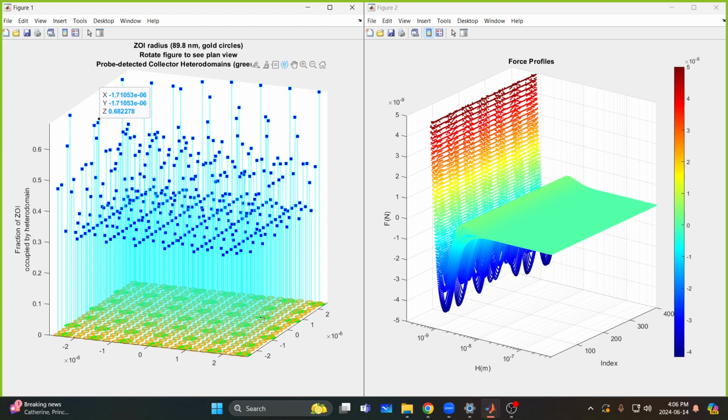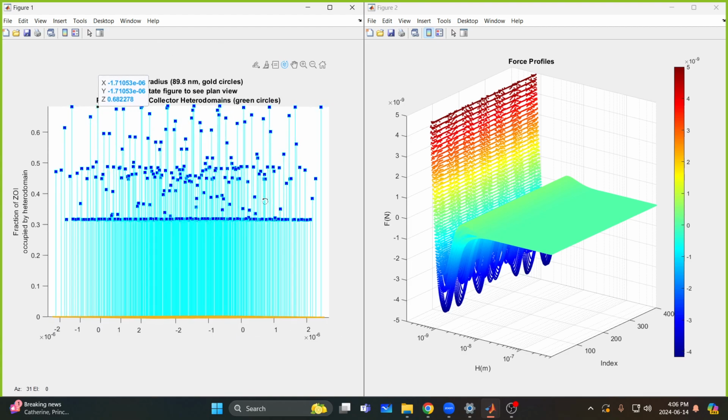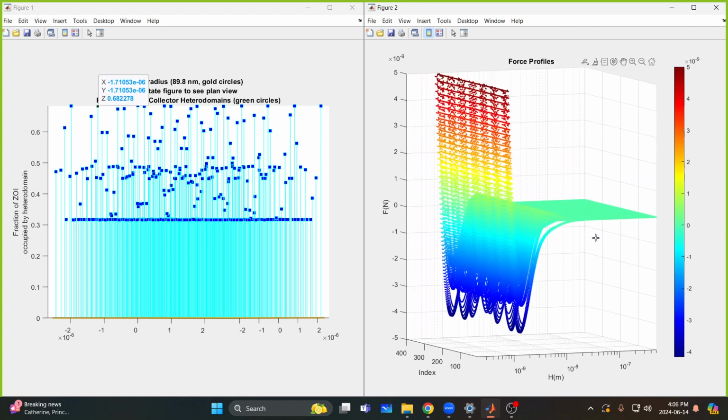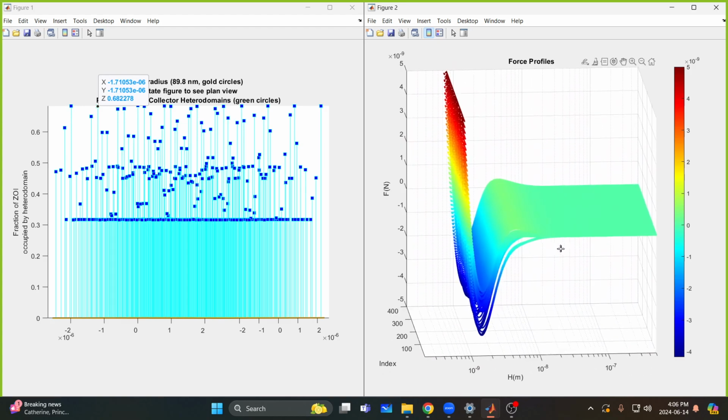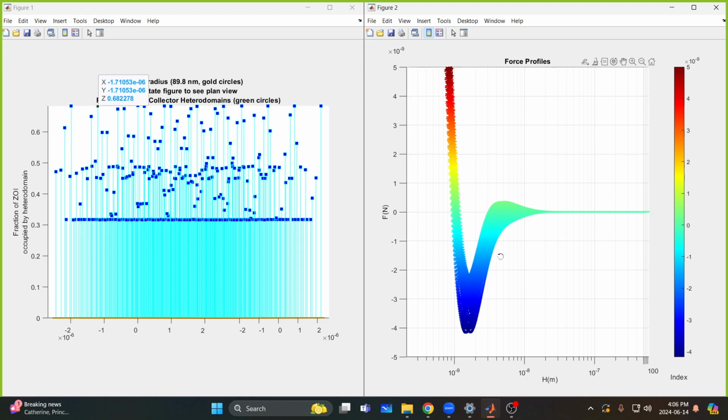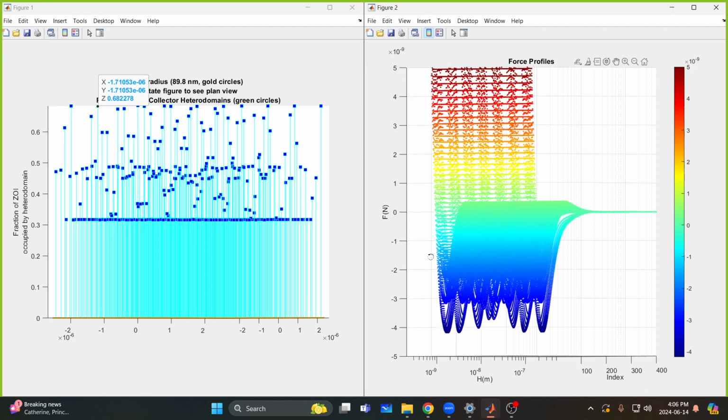Now to flip the interaction from repulsive to attractive, you have to fill somewhere around 50%, right? That makes sense. And it varies a bit because of curvature of the colloid and other things, and the zeta potential and the ionic strength, but it's somewhere around 50%, probably between 40 and 60. And so that 30% probably isn't enough to flip the interaction to attractive, but it certainly reduces the barrier. And so you can see it dampens the amplitude, as Eddie was just showing in the rotated profiles. Now there's less variability, which is interesting, right?